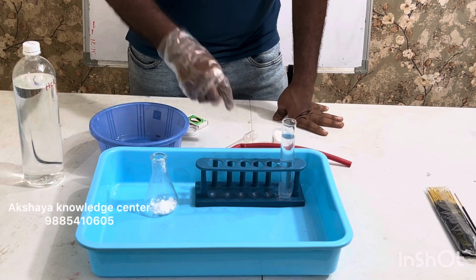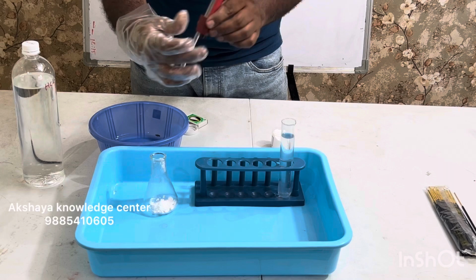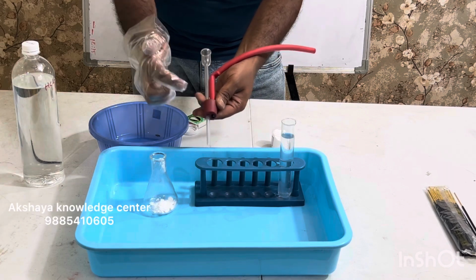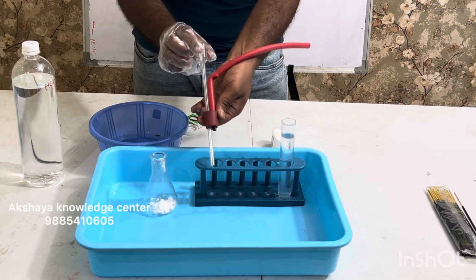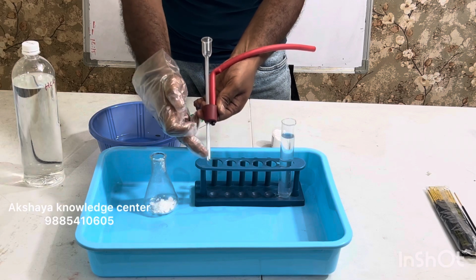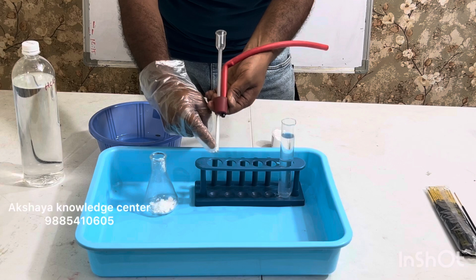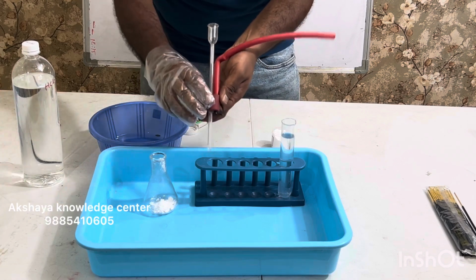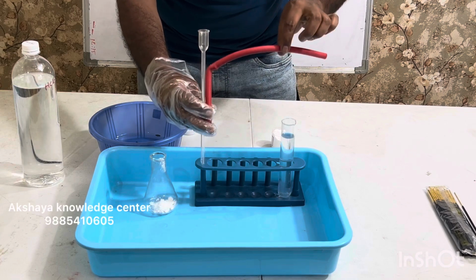So that is the reason we have this assembly. Please see this. This is a double-holed rubber cork, 2 holes. In one hole, we have this thistle funnel. It's called a thistle funnel. It has this funnel portion, and at the bottom we have a long pipe. The advantage of this is this end of the pipe could go way deep into the test tube or the conical flask. And at the second end, I have a delivery tube and a rubber pipe attached to it.